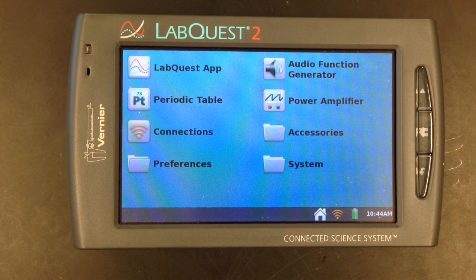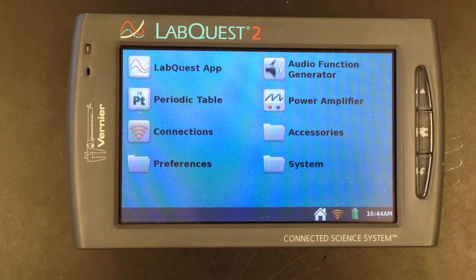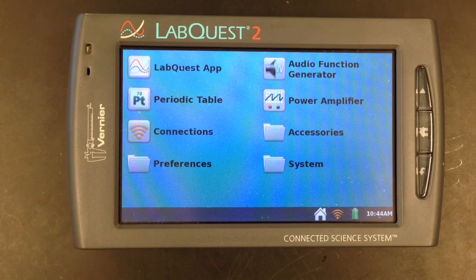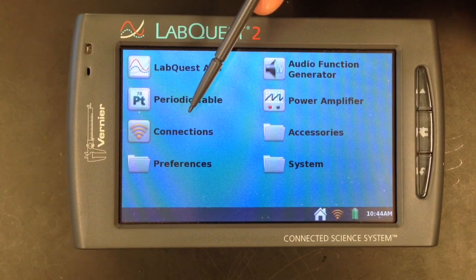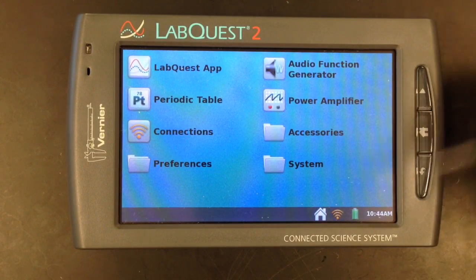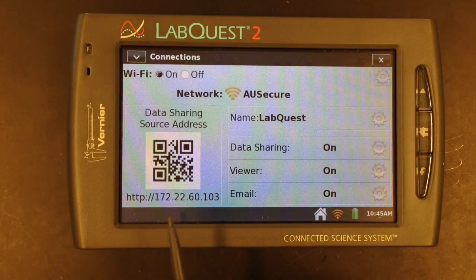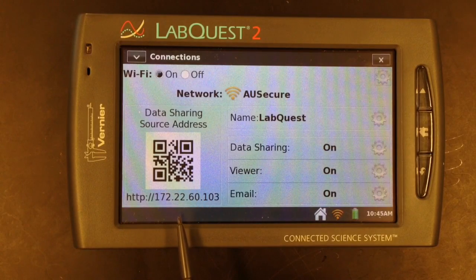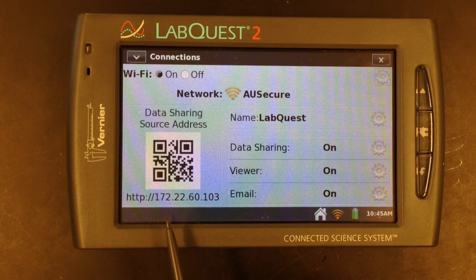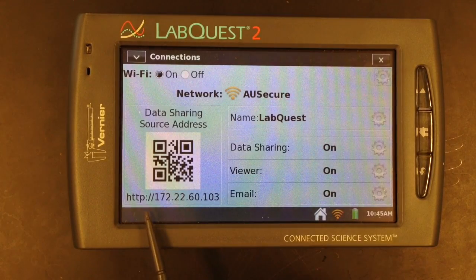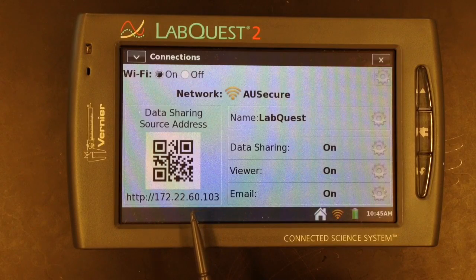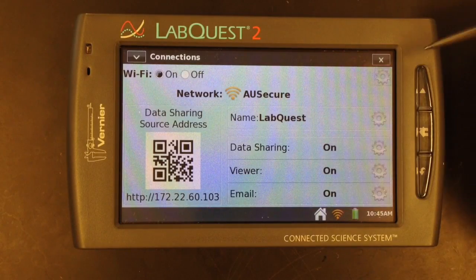One of the most useful aspects of the LabQuest 2 is its ability to wirelessly send the information you're collecting to another device without installing any additional software. You can access this two separate ways — either from the home menu under the collections tab, or at any point by tapping the wireless signal on the bottom. In the bottom left corner, you'll notice a QR code and an IP address. On any device, including iPhones, Androids, iPads, or any laptop with a current browser, just open the browser and enter the IP address, and it will instantly take you to a modified version of the data collecting screen.